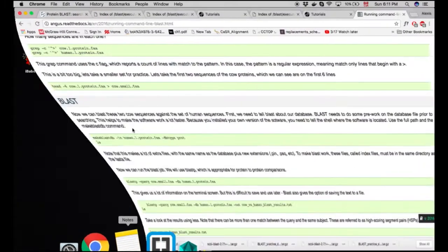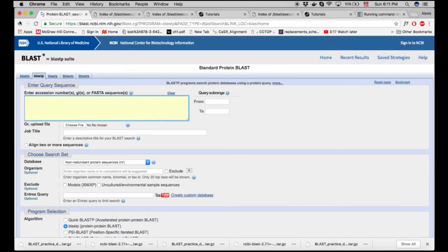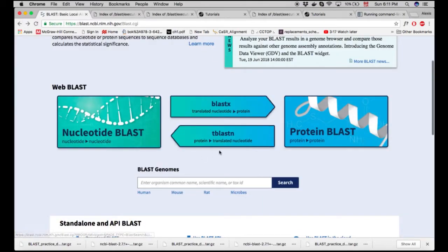You're probably already familiar with the web interface. It allows you to run BLAST-N, BLAST-P, BLAST-X, and TBLAST-N. BLAST-N is BLAST for nucleotides, and BLAST-P is for proteins.